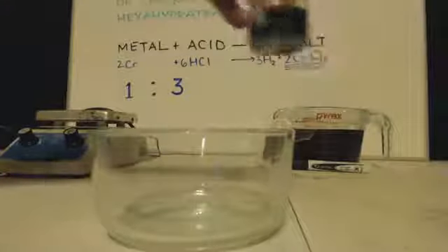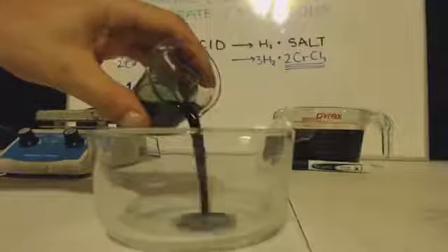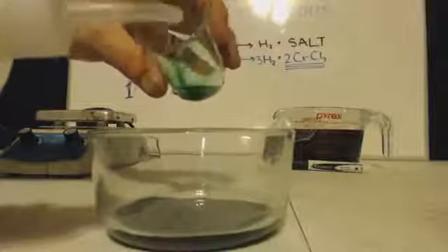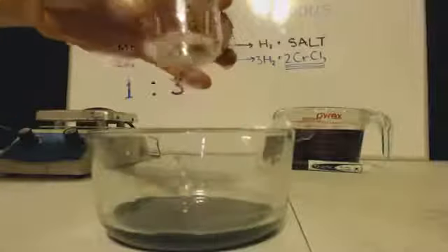Well, I boiled it down to 20 milliliters, a little bit less, and I put it in the freezer overnight, or the refrigerator, and it solidified. So I added some more water, and you can see there I'm dumping it into a crystallizing dish. I'm going to clean that out, make sure the water is crystal clear, because if it's any tint of green, then I have some more salt in there. After weeks, it finally solidified and crystallized out. I didn't really do it the correct way. I just let the water evaporate, and whatever was there was there.